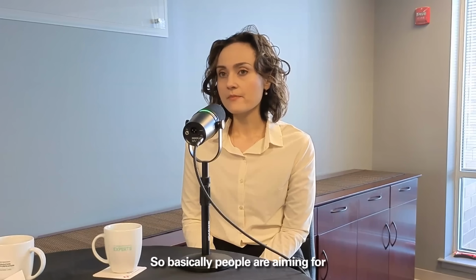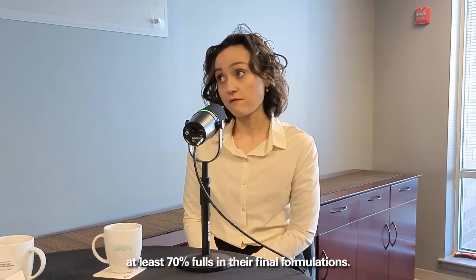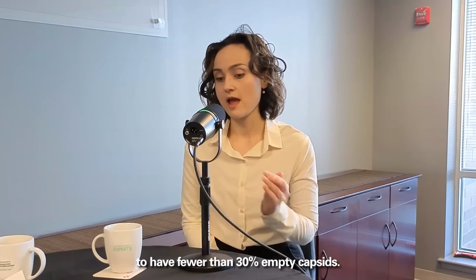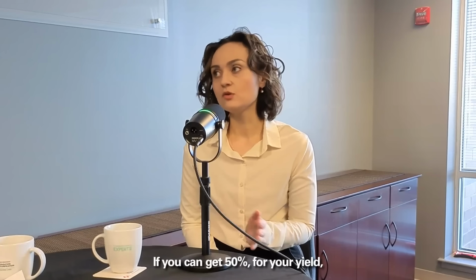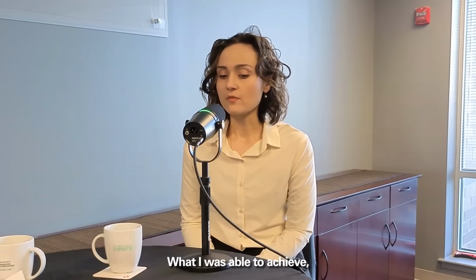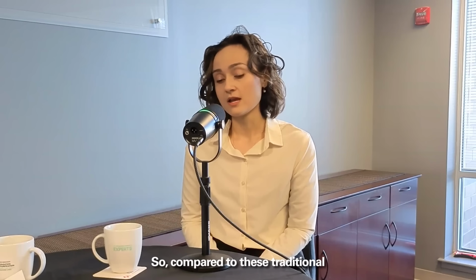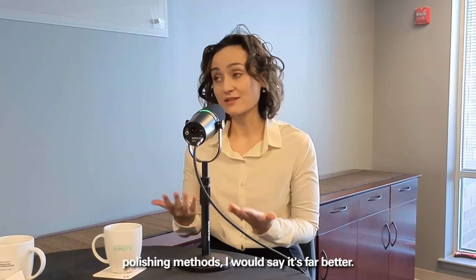Right. So basically, people are aiming for at least 70% fulls in their final formulation. That is a metric regulators have suggested, to have fewer than 30% empty capsids. And the benchmark for recovery, I would say, is about 50%. If you can get 50% for your yield, that's acceptable. What we were able to achieve was about 90% full capsids with 75% recovery. So, compared to these traditional polishing methods, I would say it's far better.